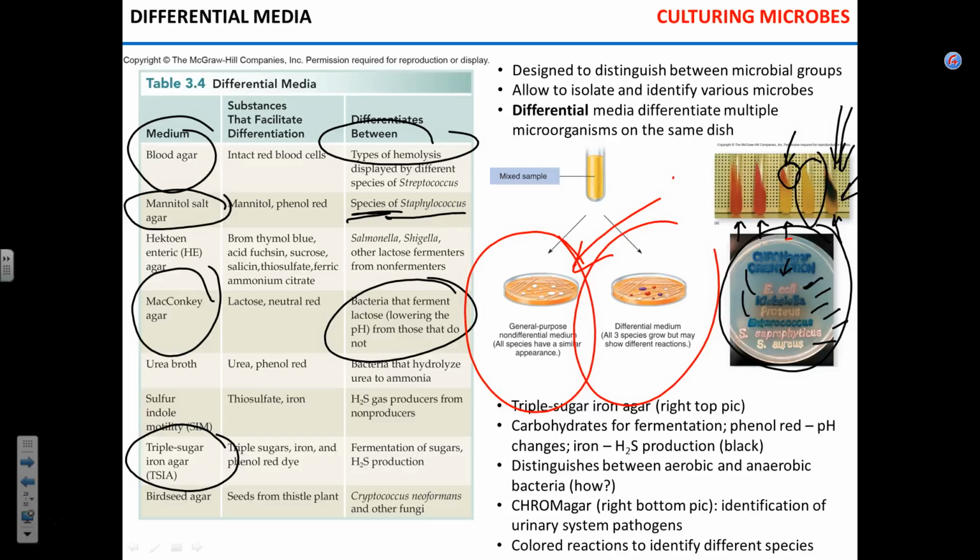Not only on the level of definition. Of course, you must answer the question: media that preferentially supports the growth of specific bacterial species and inhibits everything else is, and you pick selective, right? But I can give you an example of an actual selective medium and describe what it does.